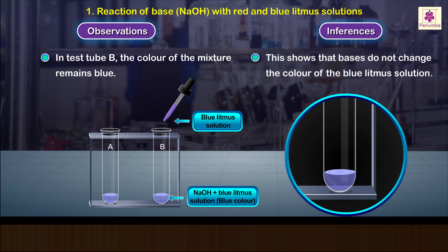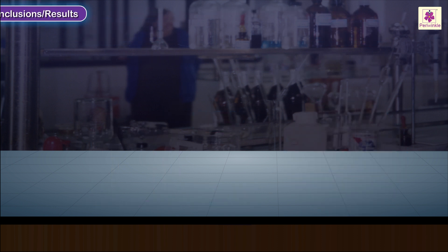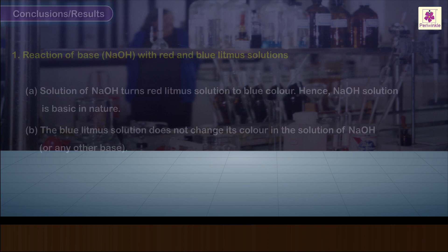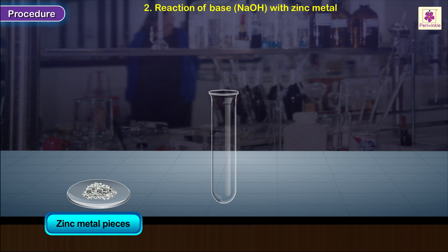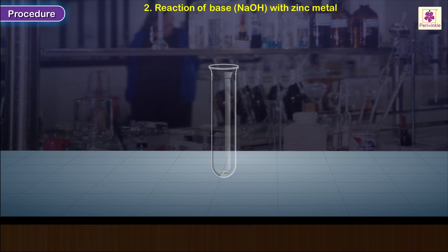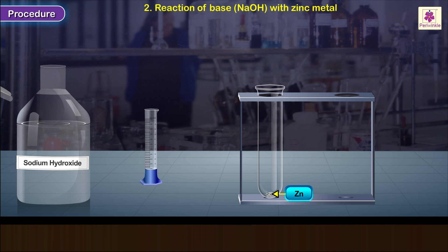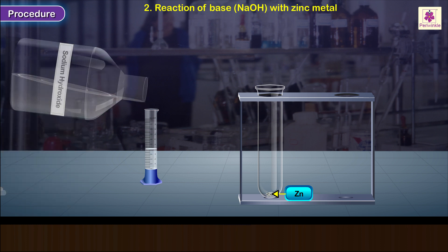Conclusions or results. Two: reaction with zinc metal. Take a few pieces of zinc metal in a test tube and place it in a test tube stand. Add some solution of sodium hydroxide to it.